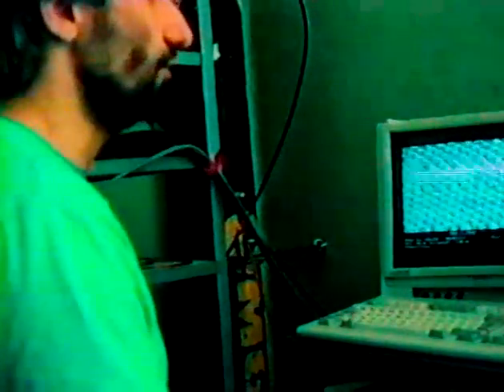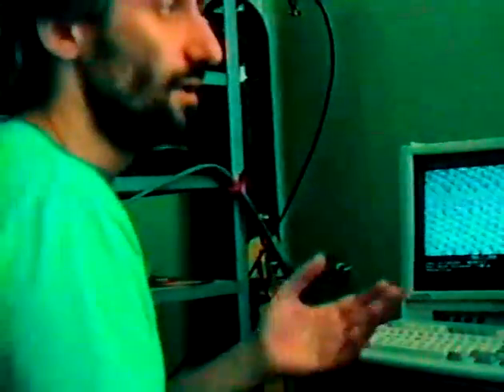Usually we use tungsten tips, but it is advisable to put some gold onto the end of the tungsten tip, because this gold can be shaped with ease, and it is much more resistant to chemically reactive gases like CO than the tungsten itself.